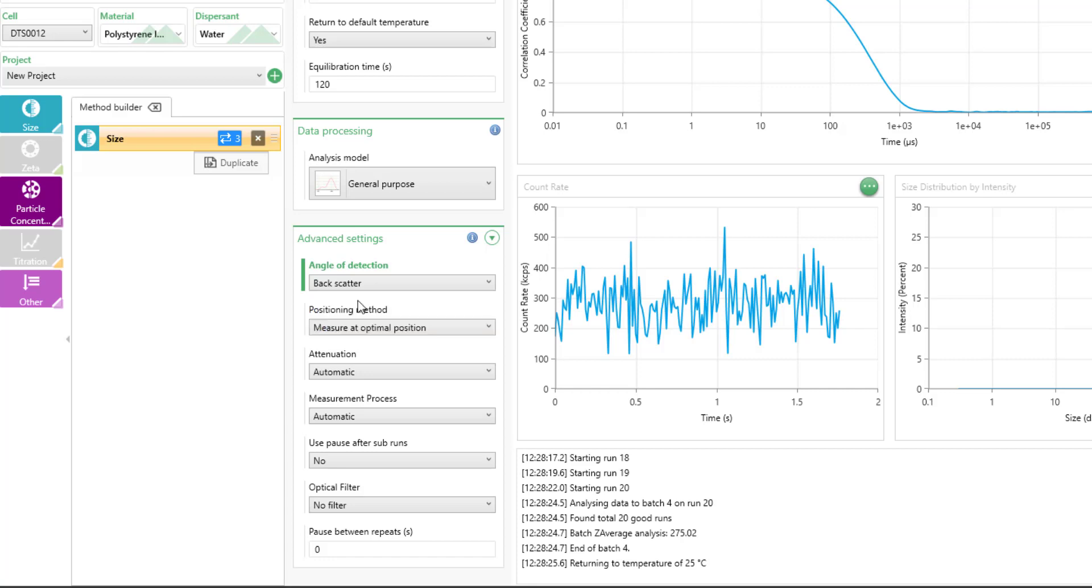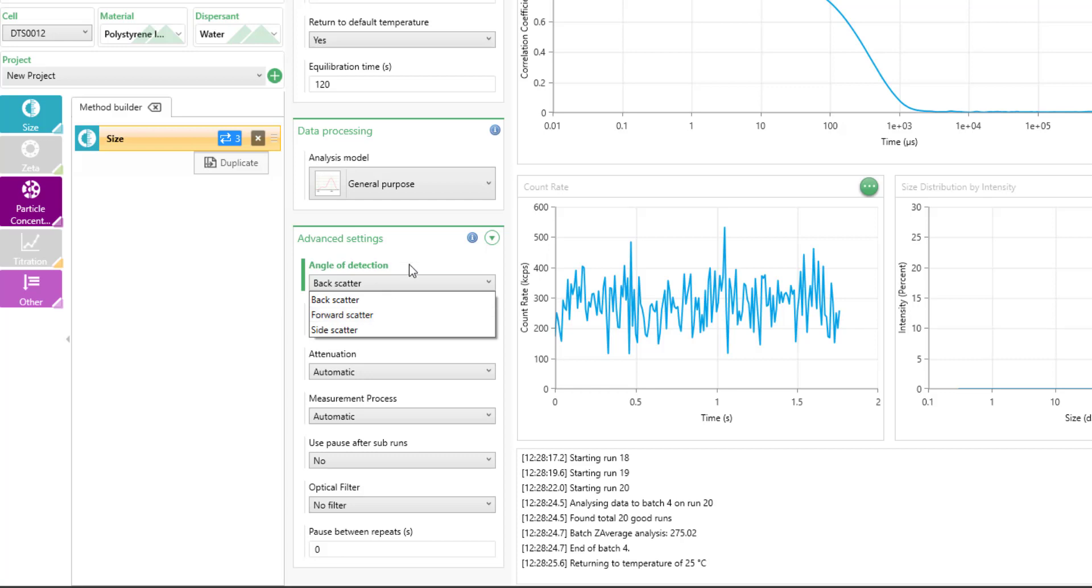Typically, you would use the backscattering angle, which is suitable for a wide variety of different concentrations for your sample. If you are particularly interested in very low levels of very large particles, you may consider using the forward scattering angle, which would be very sensitive to things like aggregation or small populations of large size within your sample.